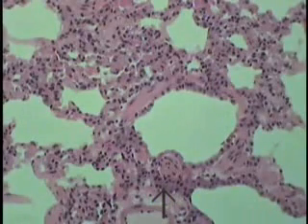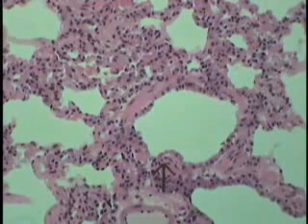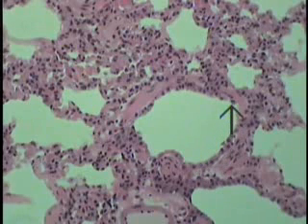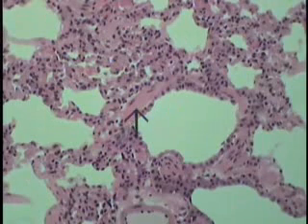Finally, one will get to the end point of the purely conducting portion of the respiratory tree at a terminal bronchiole. One of those is shown in the field cut more or less in cross section, but it's somewhat at an angle. One can see that the lining epithelium is more cuboidal in nature. We'll see that most of the cilia have disappeared. There should be no goblet cells present, but yet the wall is supported by a layer of smooth muscle, this bronchial smooth muscle wall, giving it its support.